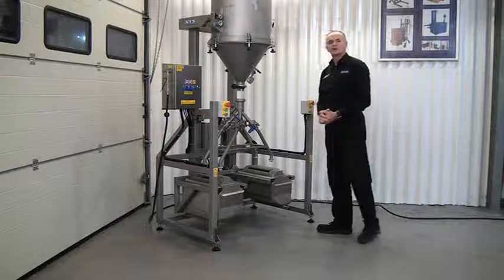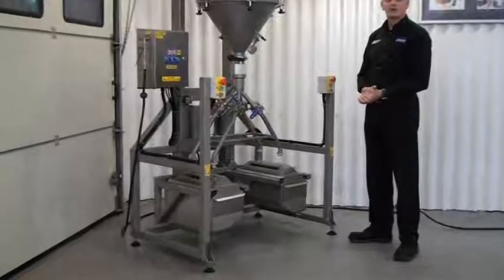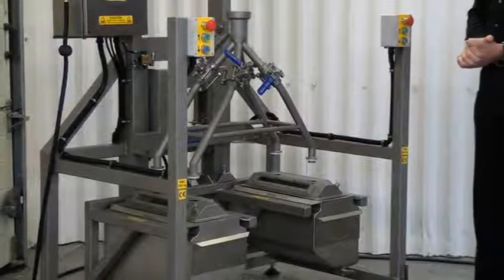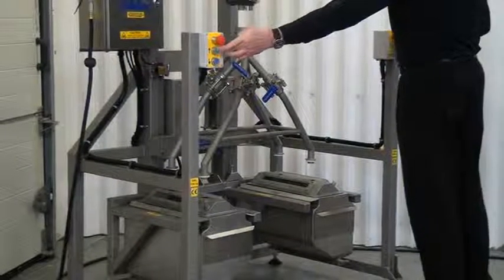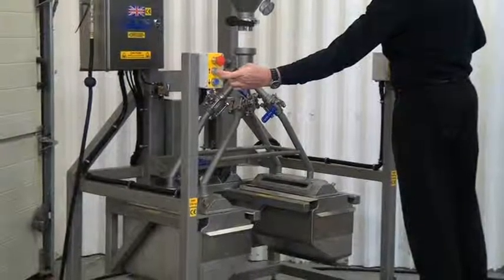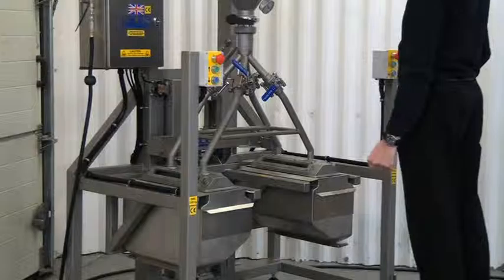What we'll do now is zoom in with the camera so you can get a closer view of how the system works. Let's press the two green buttons again to bring it up — and down.